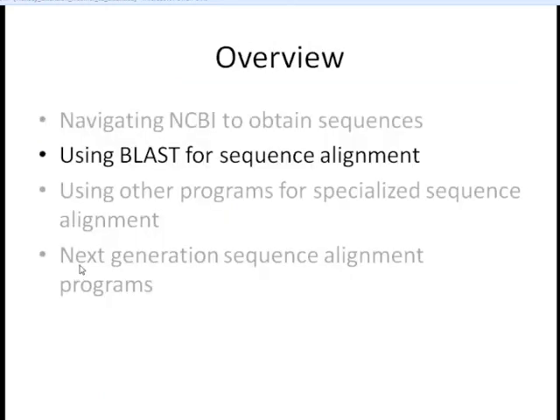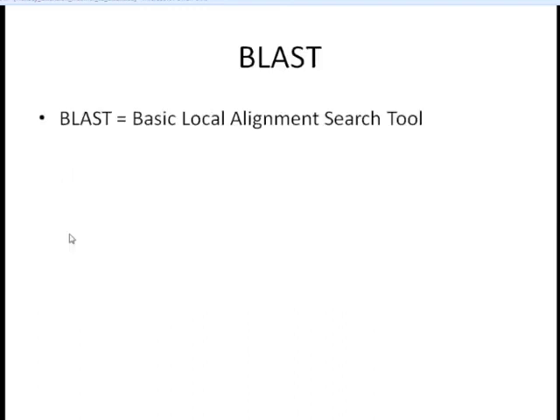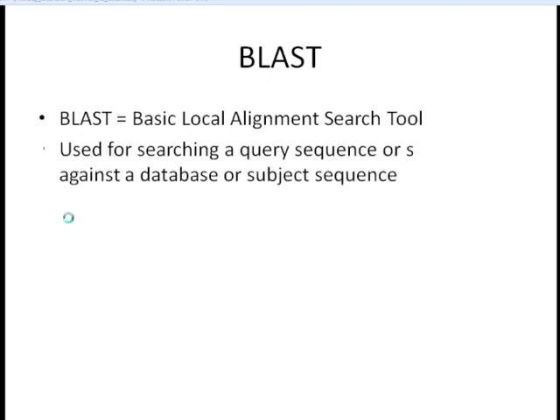Now that we have our sequence, let's go through how to actually BLAST it to a database. First of all, what is BLAST? BLAST stands for Basic Local Alignment Search Tool. It's used for searching a query sequence — such as our TB1 sequence — against a database or one other sequence.